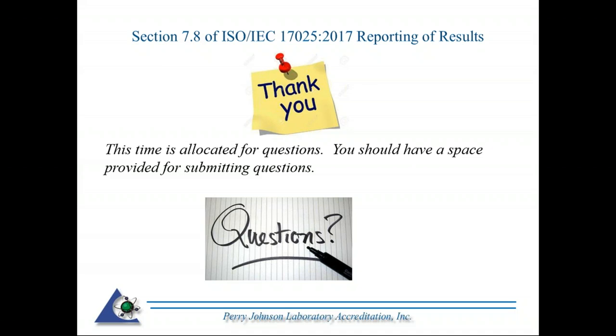You're using an uncalibrated environmental chamber by using calibrated equipment to control it. Would that be a valid method of control? It most certainly would. With temperature, look at it like an oven, and your calibrated thermometer is actually your indicator. So if that's what you're actually utilizing in your result, it's the external temperature devices. Typically, yes, using calibrated equipment to control it. If you're using that calibrated equipment to compare it to the chamber, and that's your indicator, then by all means, that's where your traceability is.